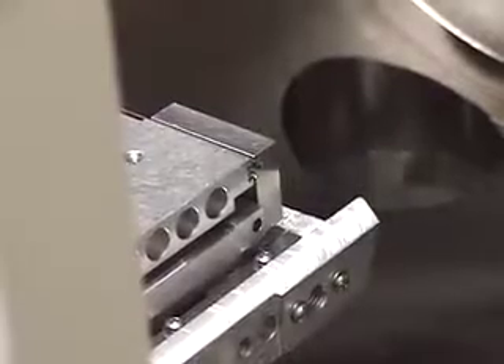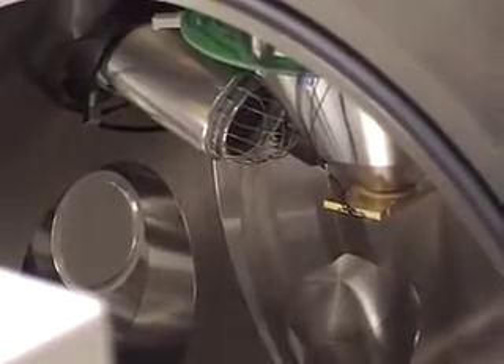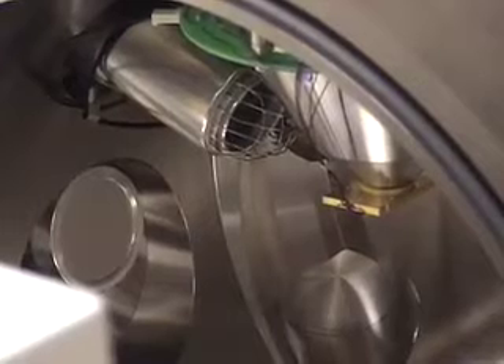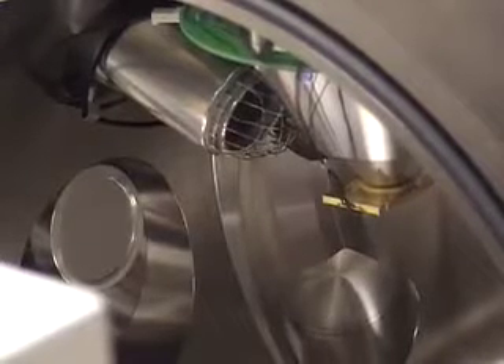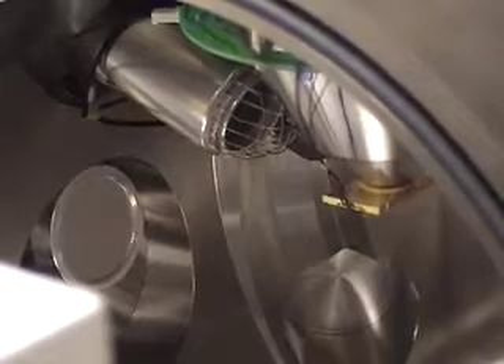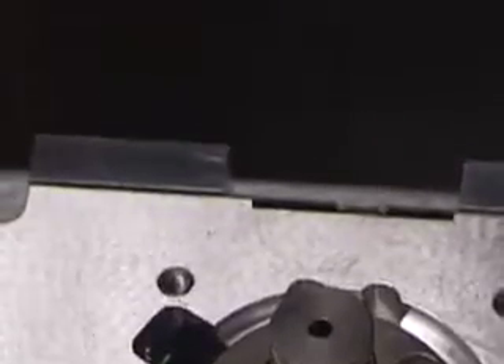With the specimen chamber door open, we can examine some of the components inside. From the left, the circular grey orientation imaging camera screen. Top centre is the secondary electron detector. Over to the right is the final lens with the brass backscattered electron detector. Here is another view looking over the top of the specimen chamber, showing the brass backscattered electron detector and the secondary electron detector.